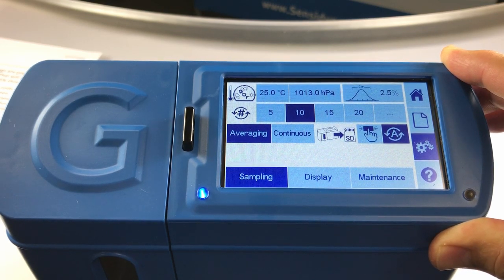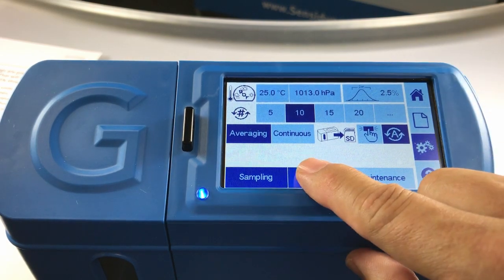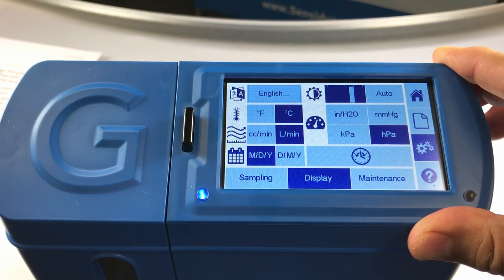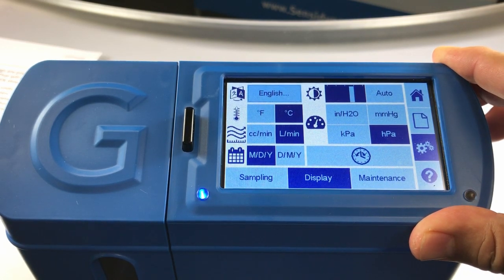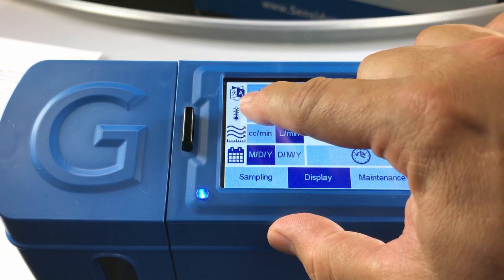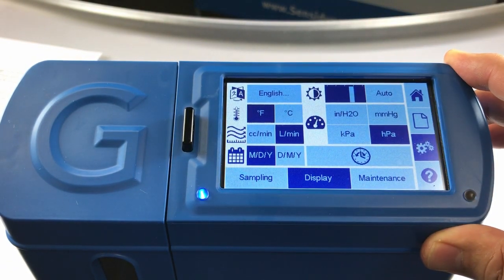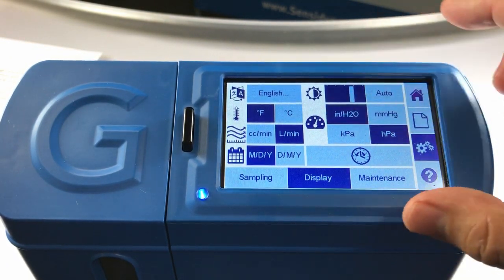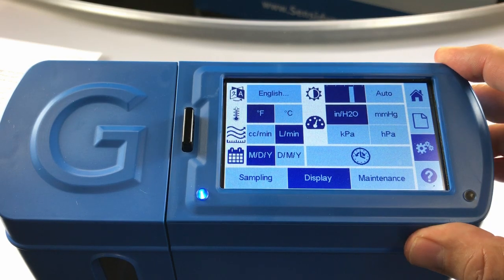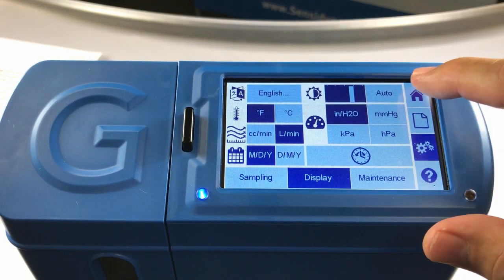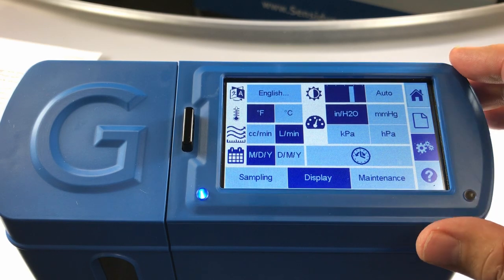Additionally I want to configure some of the units of measurement, so I will open my display screen. From here I'm going to change my degrees Celsius to degrees Fahrenheit, and I'm also going to change my hectopascals to inches of water. I can then touch my home screen button to return to the home screen.